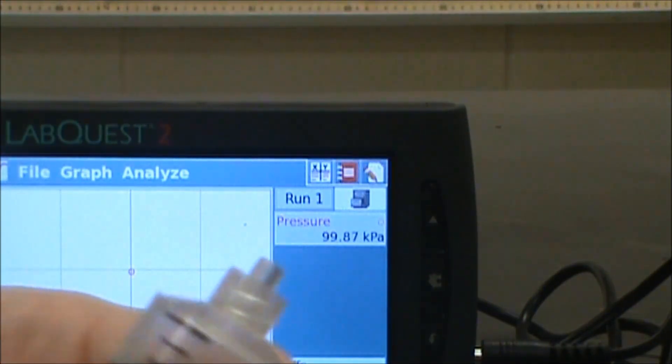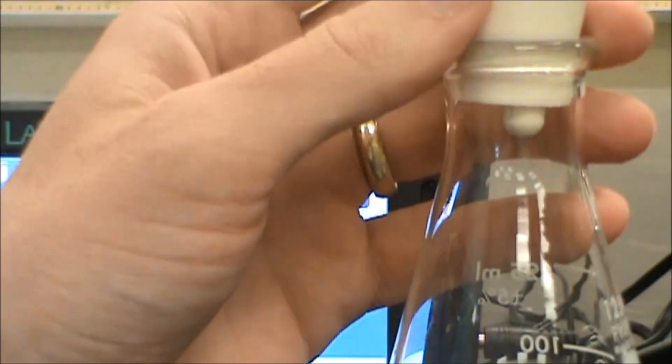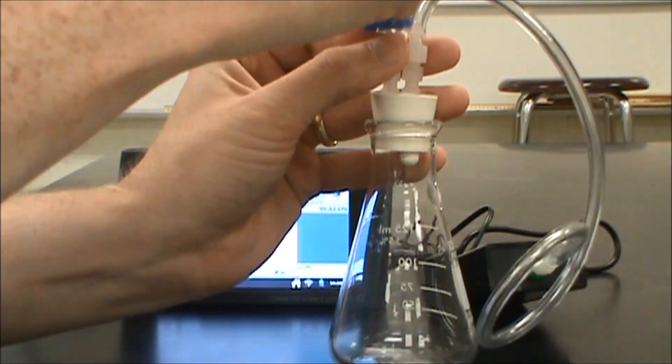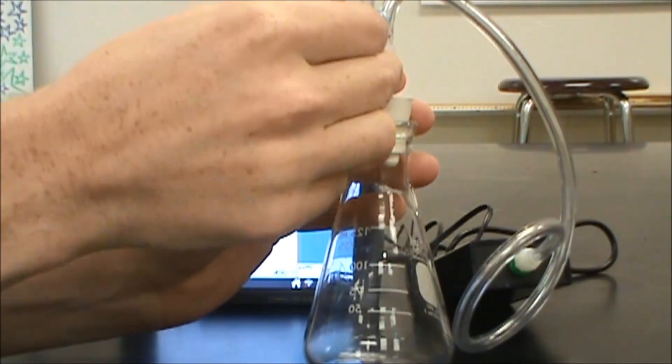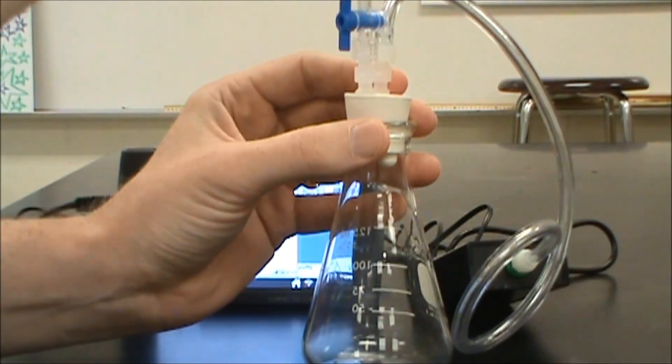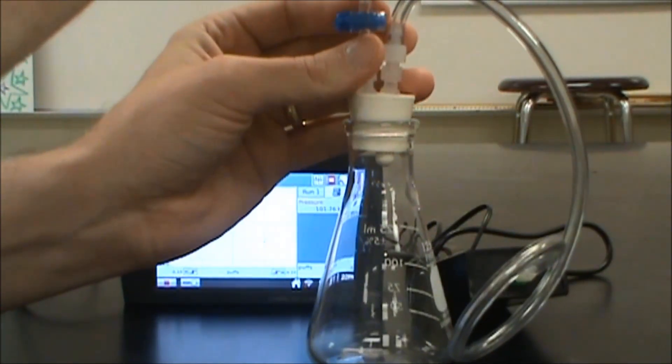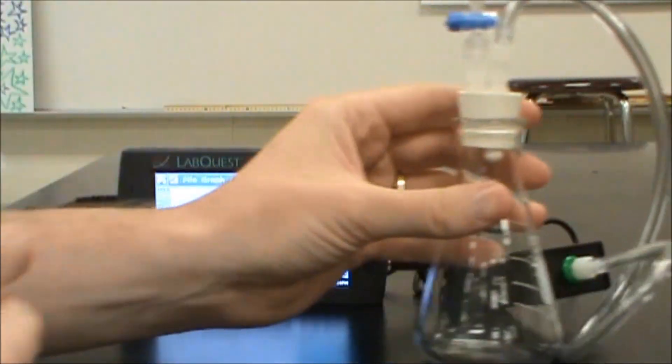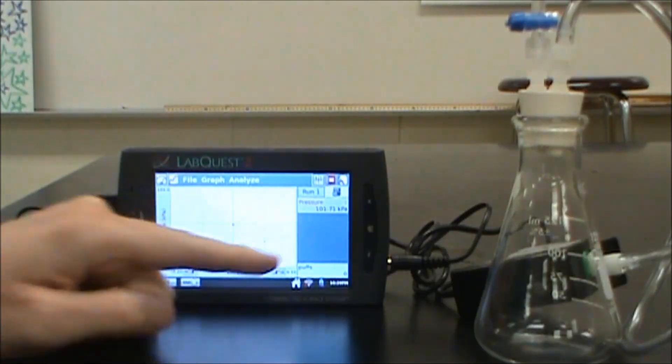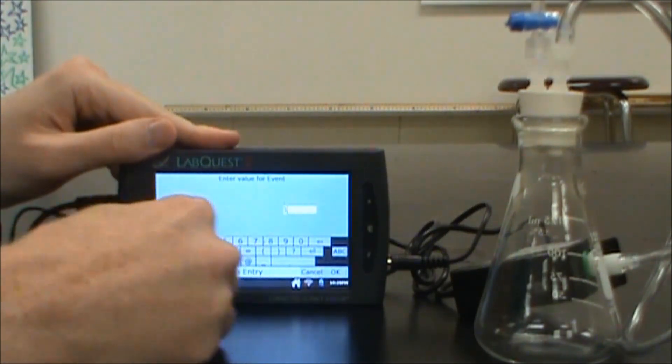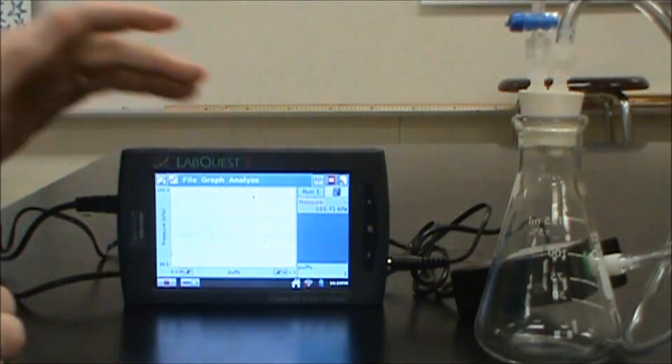Now I'm going to get a puff ready. I'm going to take three milliliters and I'm going to hook it up to my apparatus. Zoom out so you can see. Once this is securely attached, I'm going to open it. I'm going to push that puff in. While holding it down so it can't go back, I'm going to release, take that off. Now my pressure should have changed. I'm going to hit keep. I'm going to put in that I've put in one puff. OK.